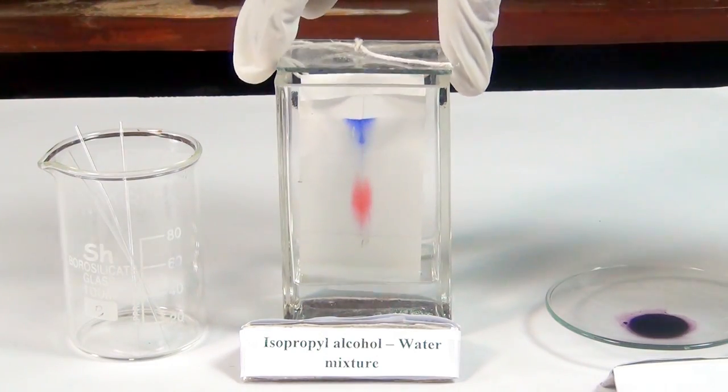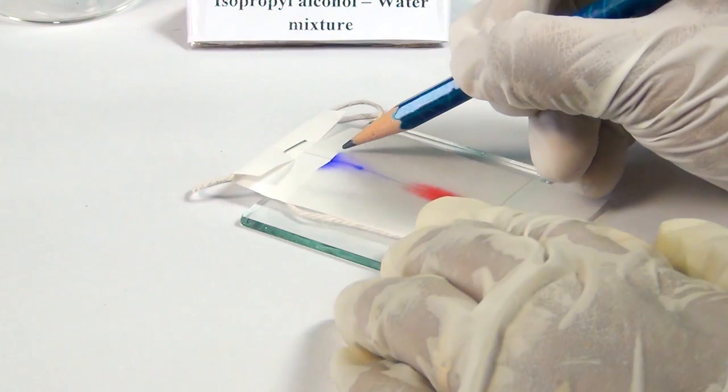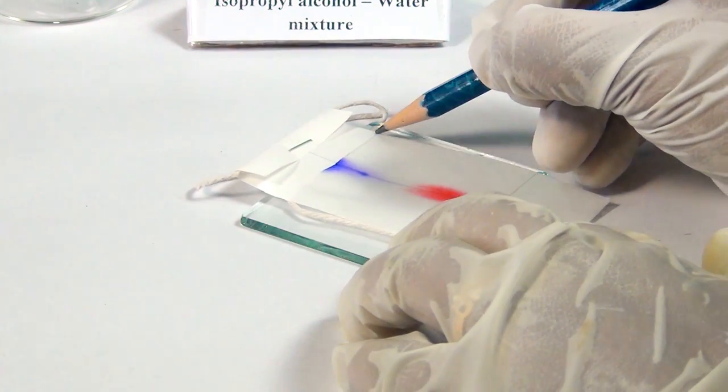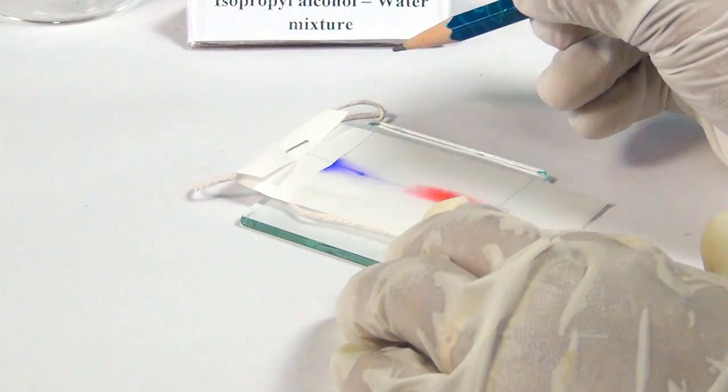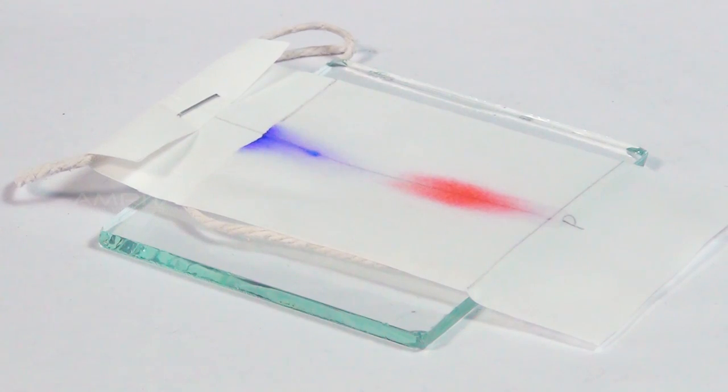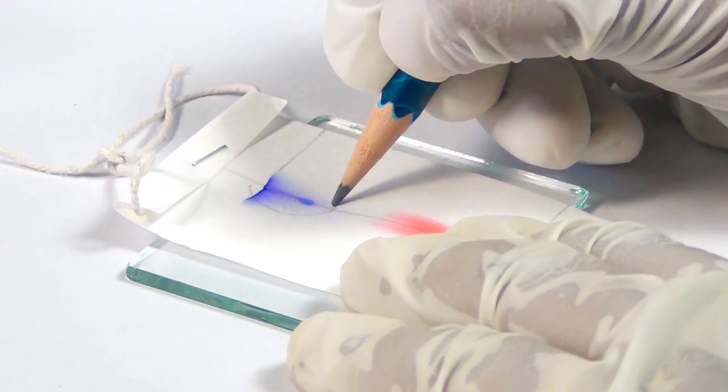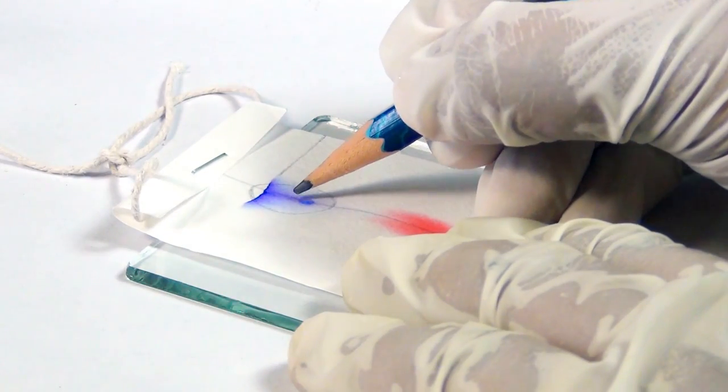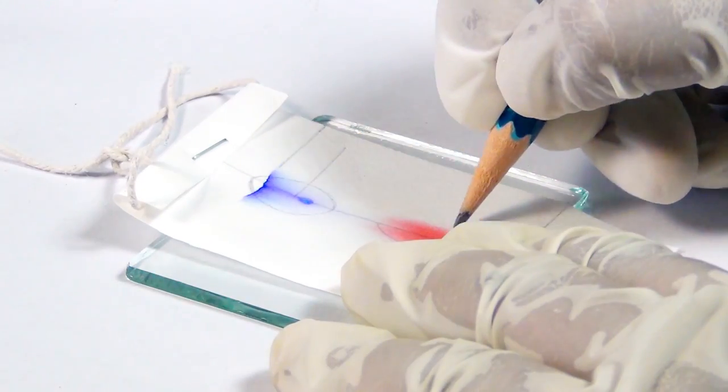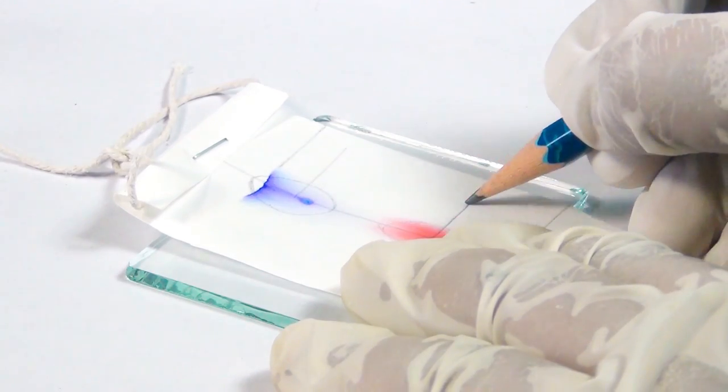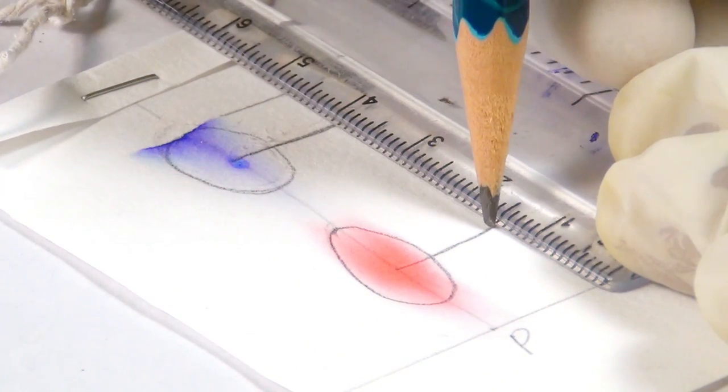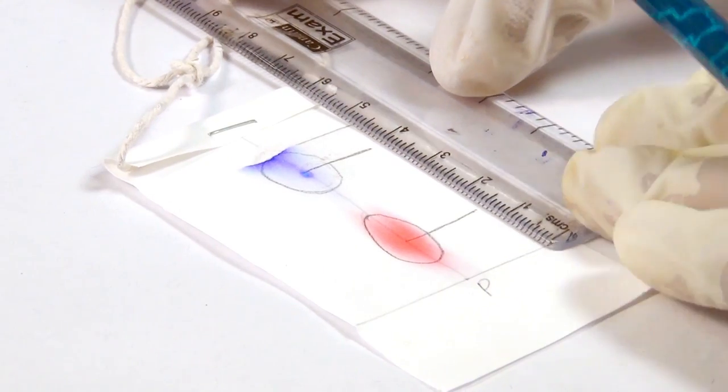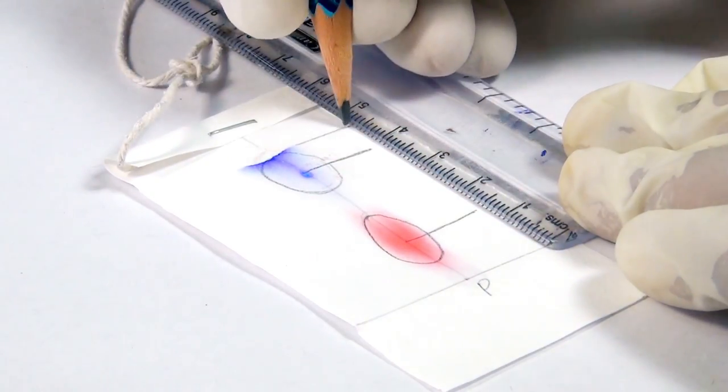Take the filter paper out of the chamber and mark the distance that the solvent has risen on the paper with a pencil. This is called the solvent front. Dry the filter paper and put pencil marks on the centre of the red and blue ink spots. Measure the distance of the two spots from the original line and the distance of the solvent from the original line.